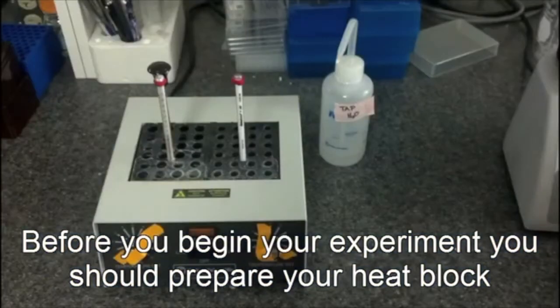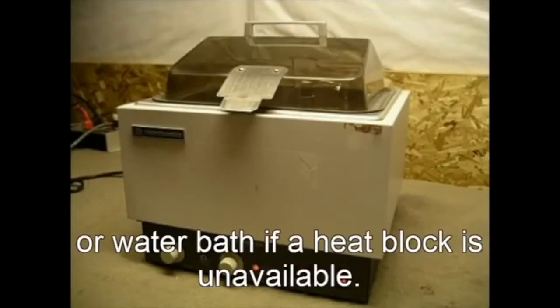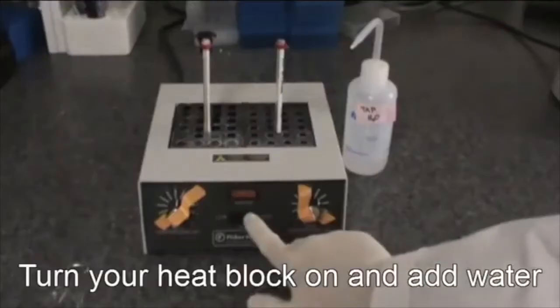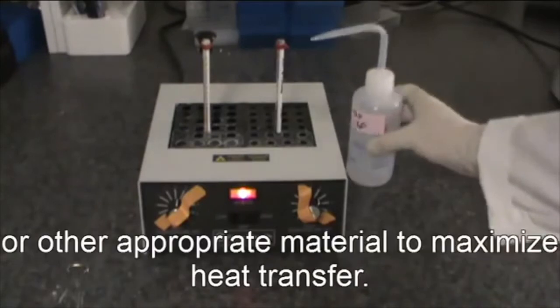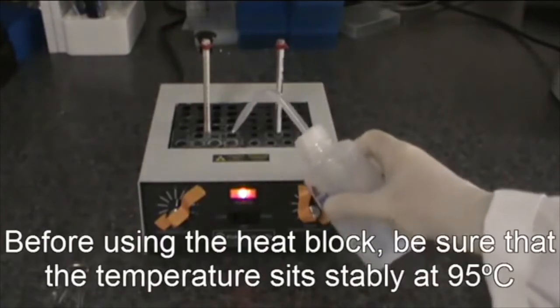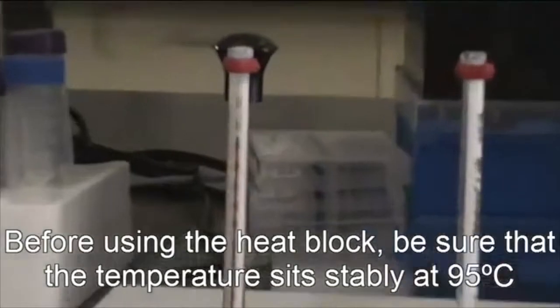Before you begin your experiment, you should prepare your heat block or water bath if a heat block is unavailable. Turn your heat block on and add water or other appropriate materials to maximize heat transfer. Before using the heat block, be sure that the temperature sits stable at 95 degrees Celsius.